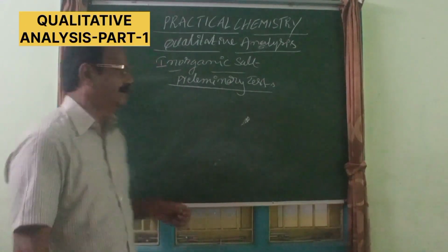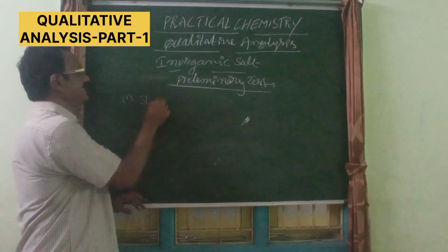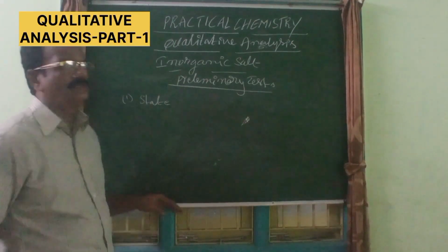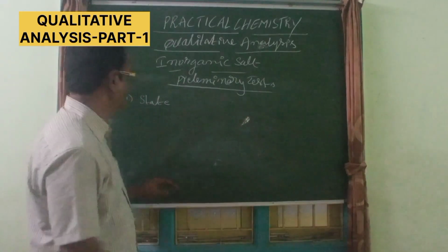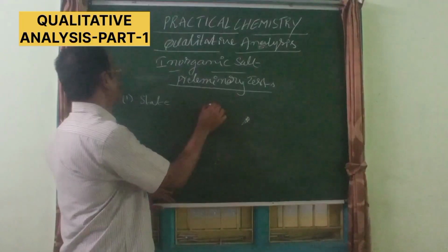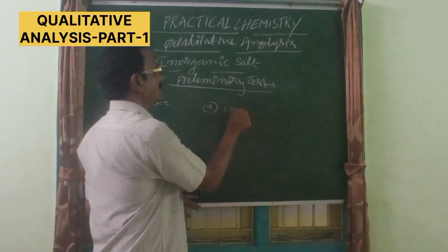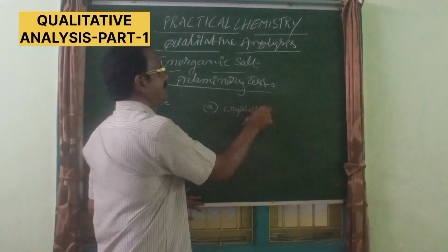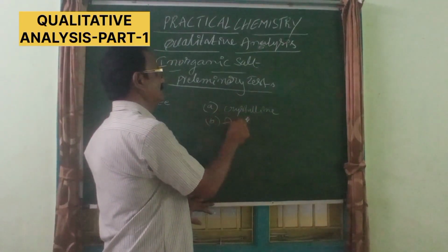Let us consider the first preliminary test, the state. Here two observations can usually be made. The given inorganic salt may be crystalline or amorphous.